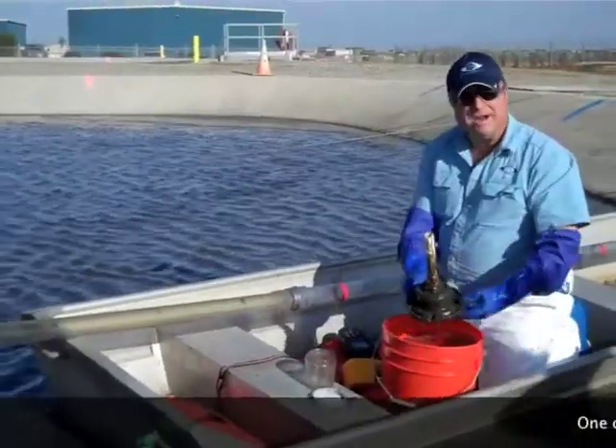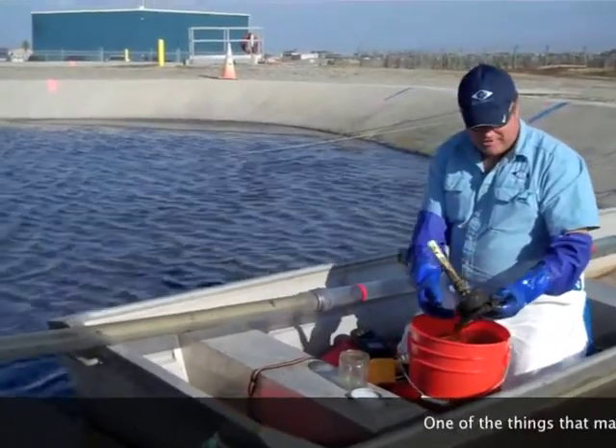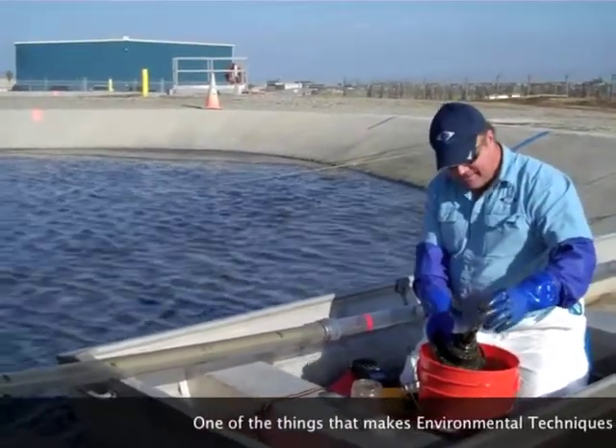In case you were wondering how I was able to check my foot valve, this is a little trigger device that we have, just made out of PVC. Put it in the bottom and this will activate the foot valve.